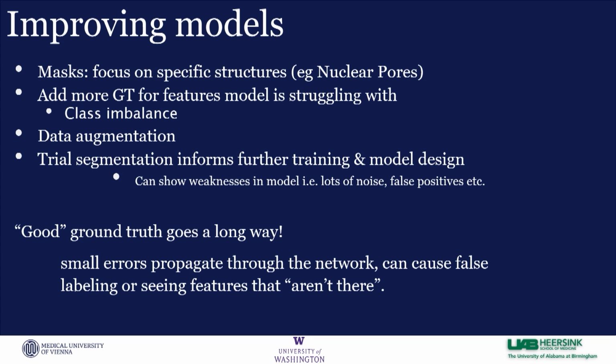So if you're a bit lazy sometimes, like I might be, and you do a bit sloppy segmentation, then those errors will propagate through the network and cause you some issues. So just take your time and do clean ground truth. Don't confuse the model.